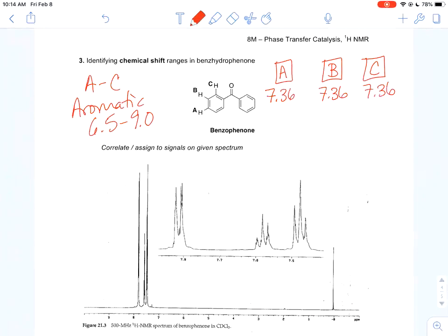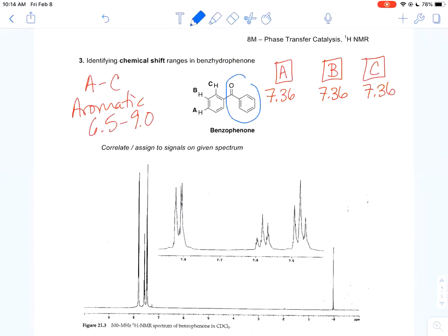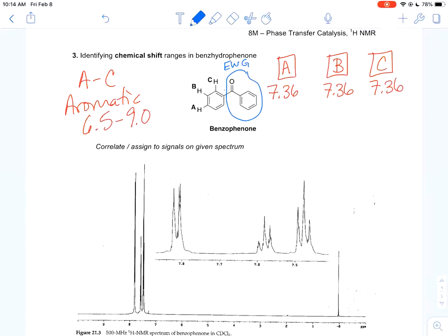So depending on the proximity or just the relative position of each group to the tables or to the substituent, we're going to have shielding or de-shielding effects. And one thing before I switch back over to the table that I want you to keep in mind is that this is going to be a really nice, strong electron withdrawing group, which means it's going to be de-shielding or pulling electrons away from each of those protons, some more than others.